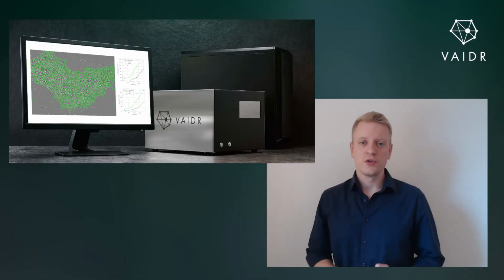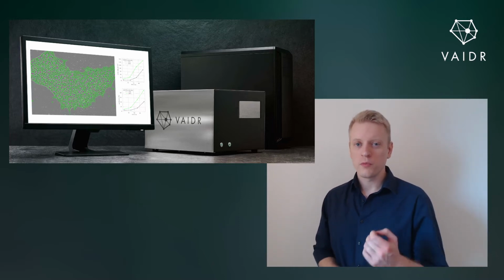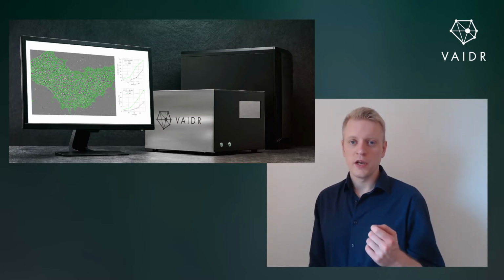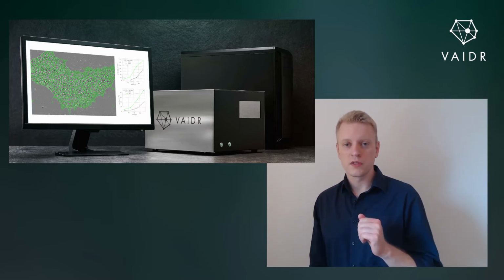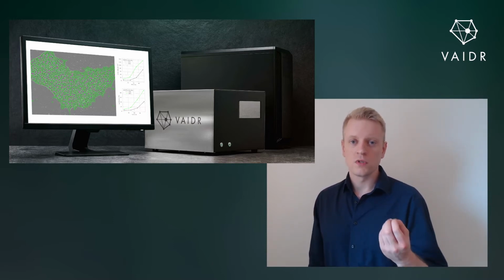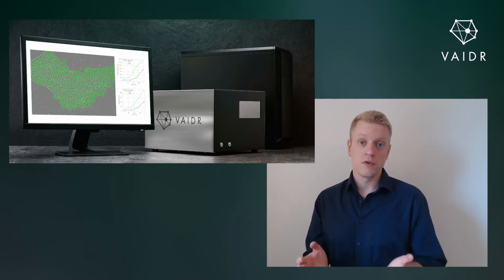Welcome to another video on VAIDR, and this time we want to talk about iPSC cell culture and how to control it, how to make sure that the cells are doing okay, and how to get those quality metrics in an efficient manner without disturbing the cells, without having to stain them, without having to kill them, so you can really focus on their quality and use them for those subsequent experiments that are probably very important to you.